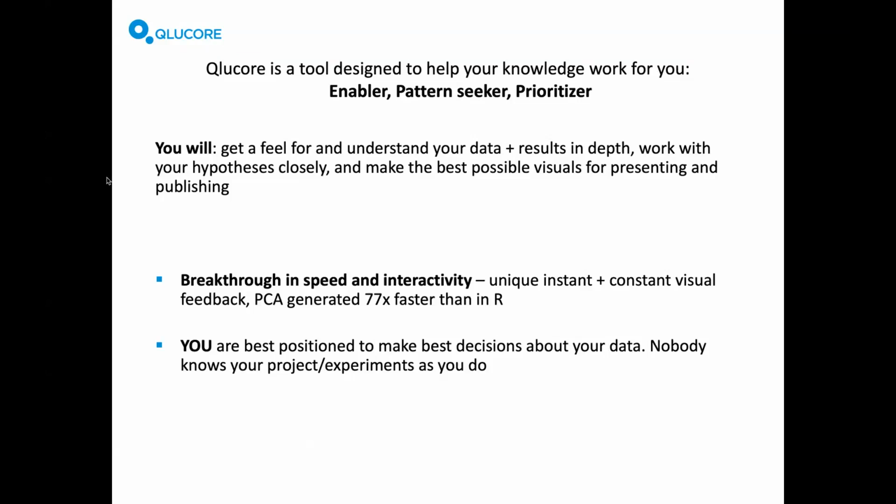And with the speed, I mentioned that, for example, if you look at just a PCA plot created, it will be generated on the regular laptop, like I'm working on the MacBook. It will be generated 77 times faster than the same plot will be created in R, which is a big benefit for you working on your regular computers. And also it's a huge benefit for mental processing of the information, as long interruptions between steps and pictures will be slowing down and making the way you think about your work less efficient.